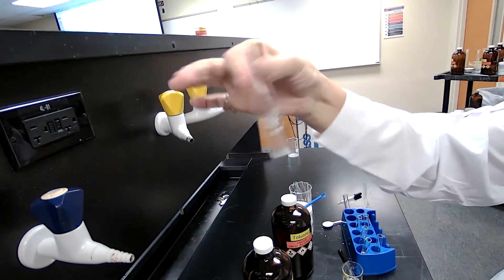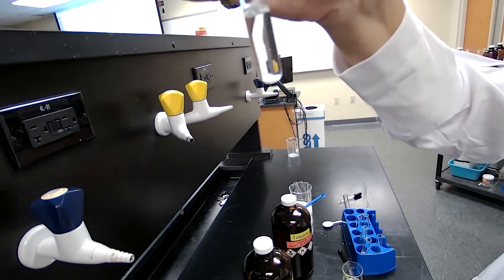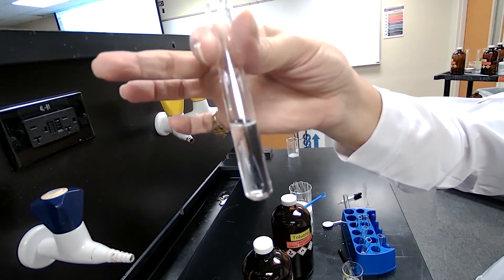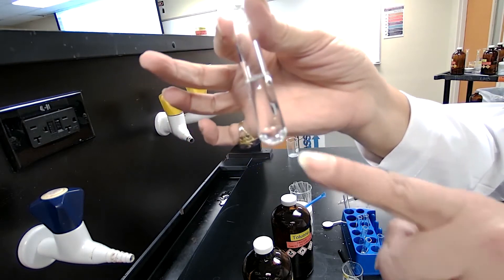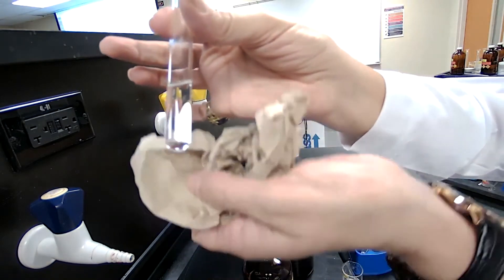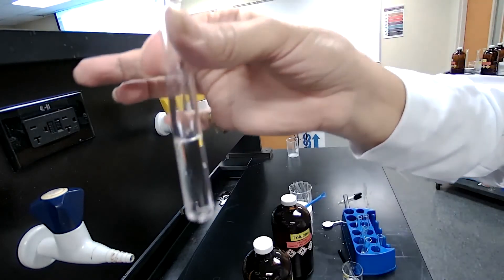Agitate it and look for the result. If naphthalene disappears it would be one phase, and if it stays there it would be two phases. I'm turning the tube so you can see from different angles. In this case I don't see any solid. You can record your observation — with this background it would be better — so you have the solution of naphthalene in toluene.